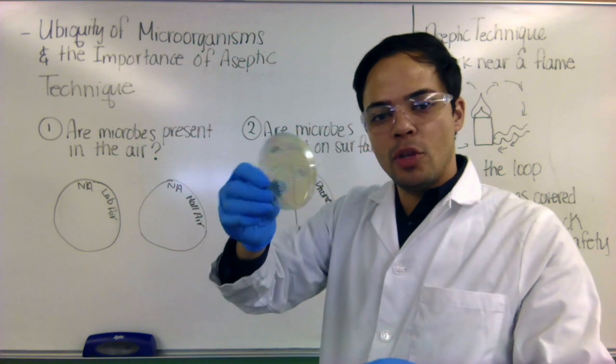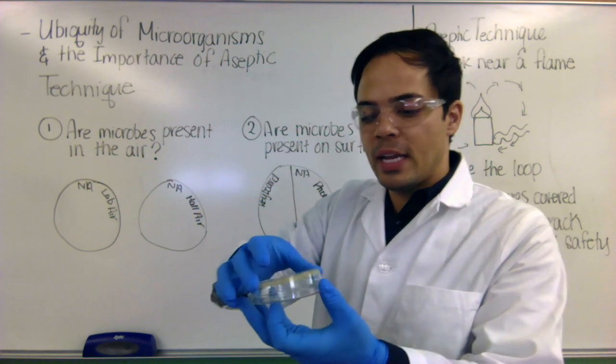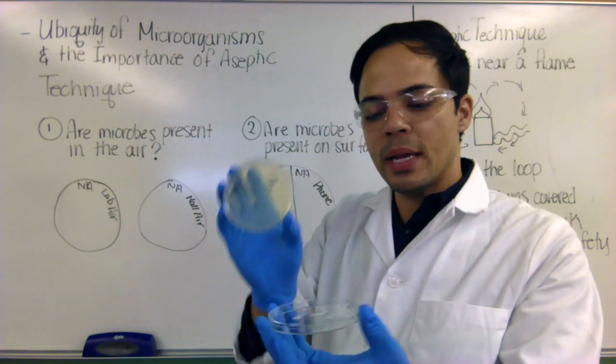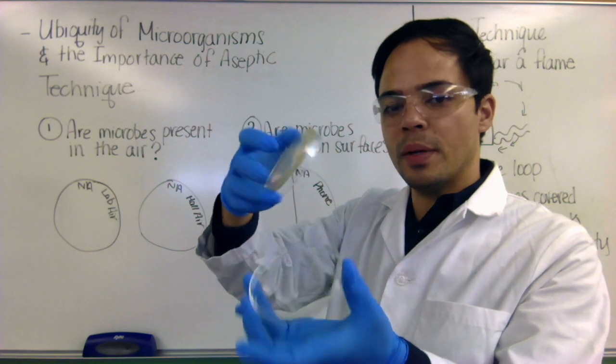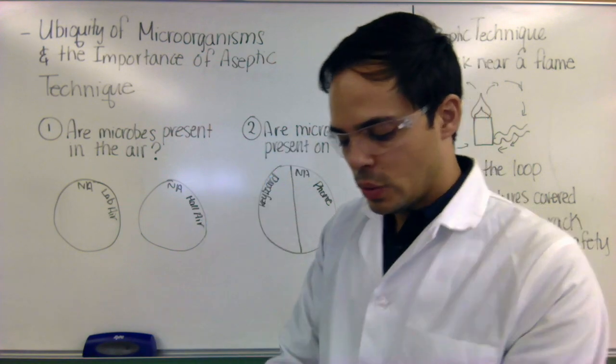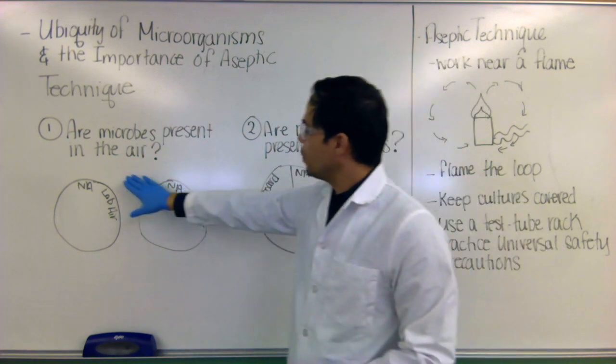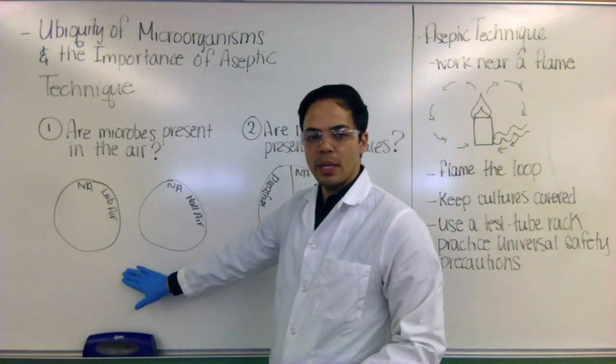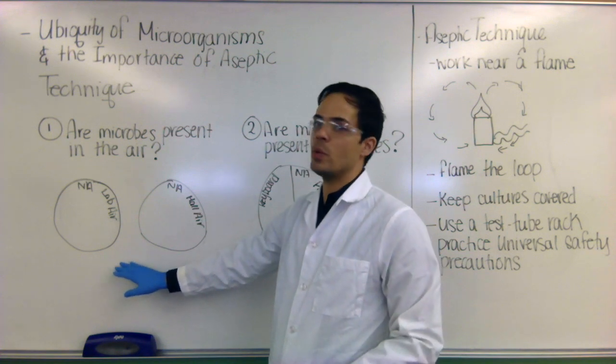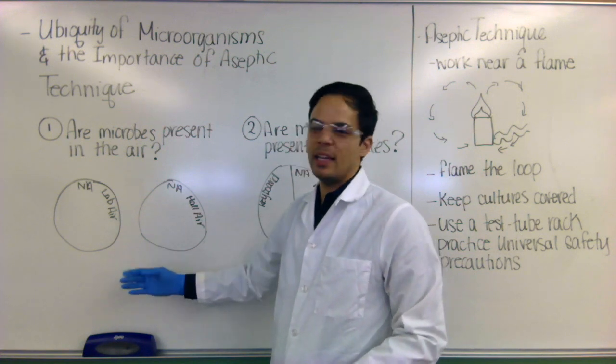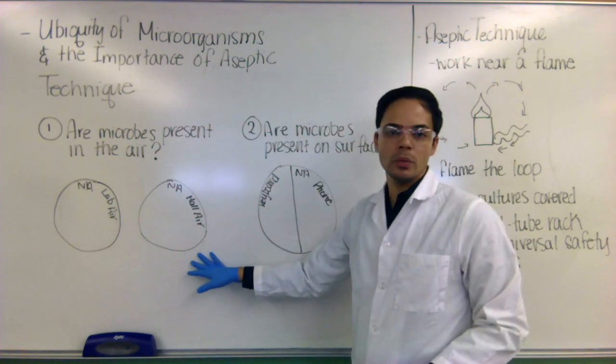And then when you're done, you want to go ahead and cover it back up. And then incubate it upside down. And that will prevent any condensation from growing on your media. You can actually see the condensation will go on the lid, because we don't want our bacteria swimming around in that liquid there. So we're going to leave that one open for now. And so when we come back after incubating this, you can incubate this at room temperature for like a week, or you can put it in a 37 degree incubator, and then it should only take a day or two for colonies to form.